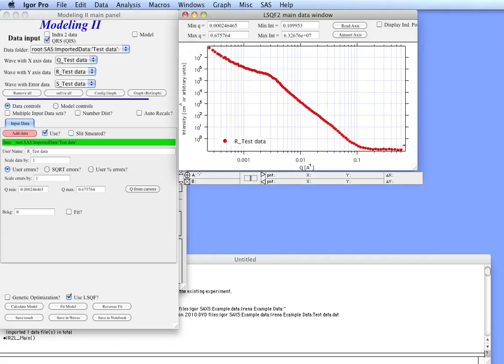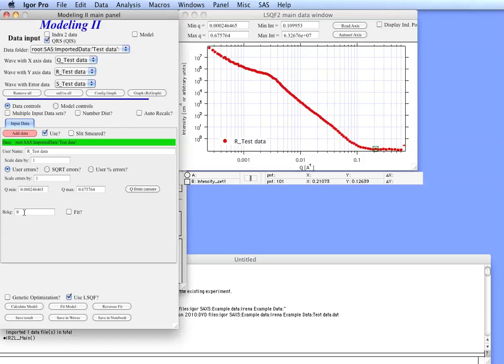The thing which we need to do is you probably need to input a background here because it belongs to the data in this tool. If we put a cursor on the background we can see it's about 0.12, so let's just include that as 0.12.